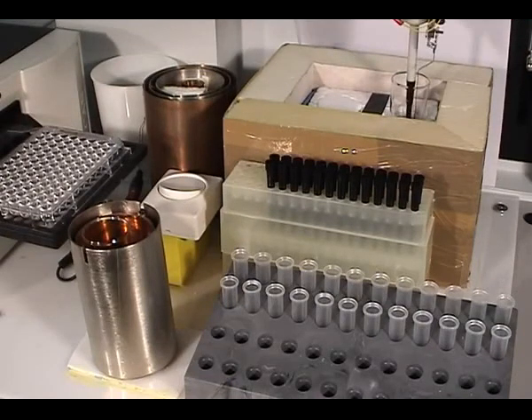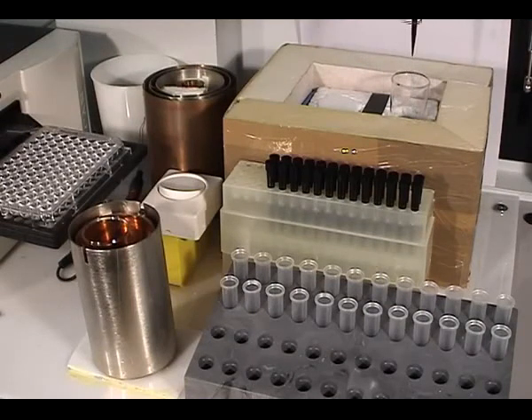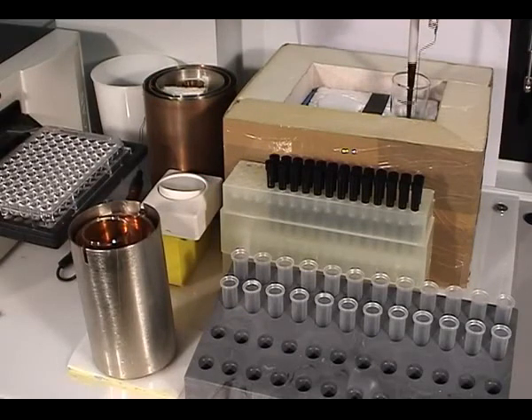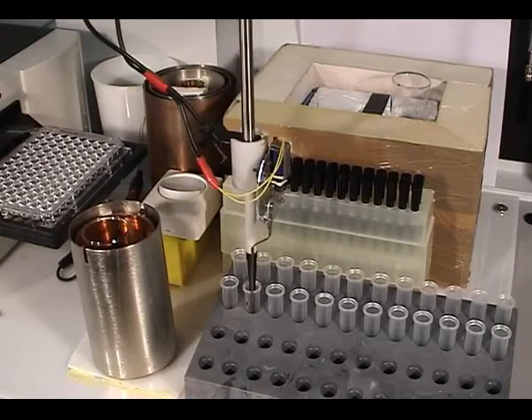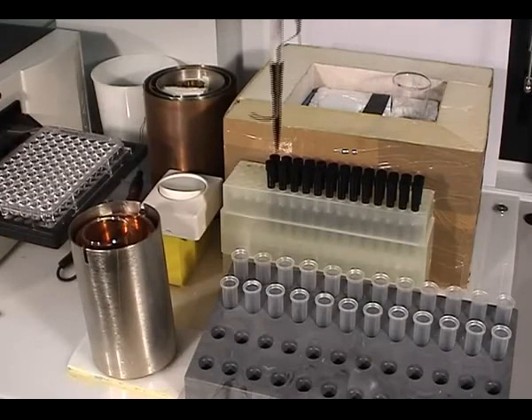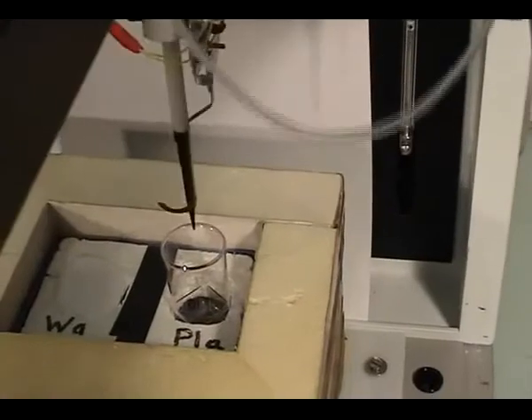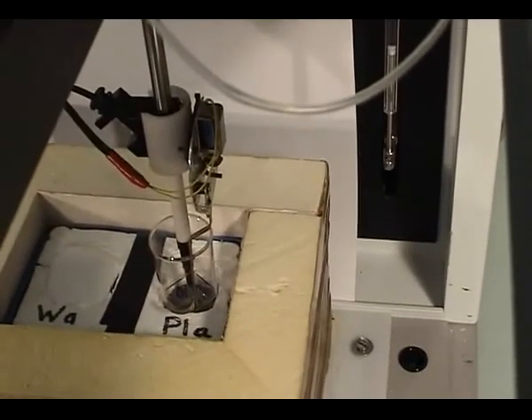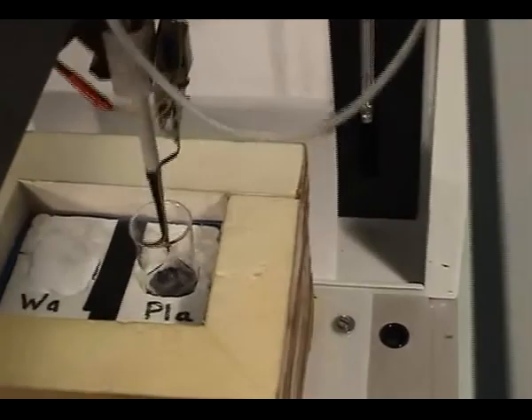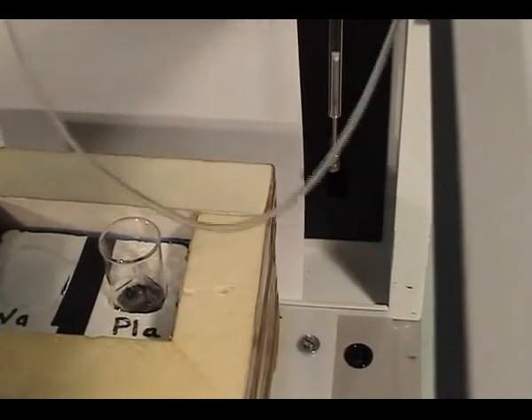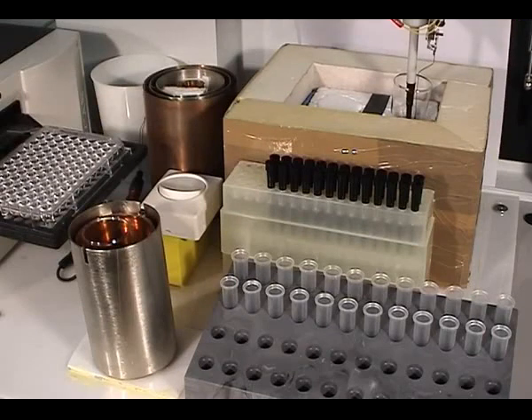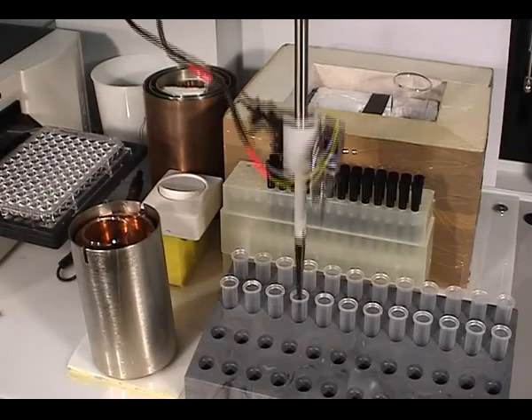Then it will do the same for the second tube, twice, and the third tube. And you can see the syringe moving up and down that is aspirating and rejecting or spitting out the organ.